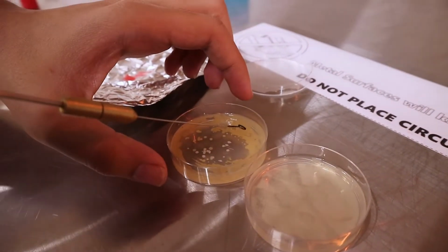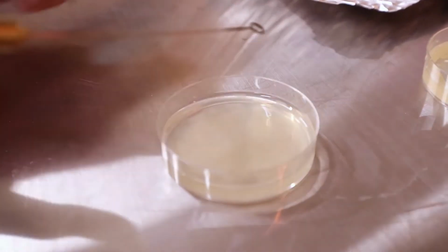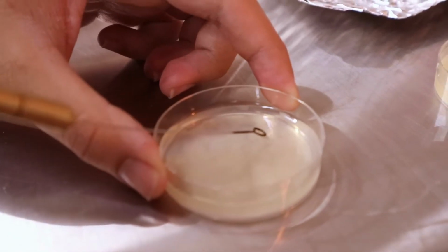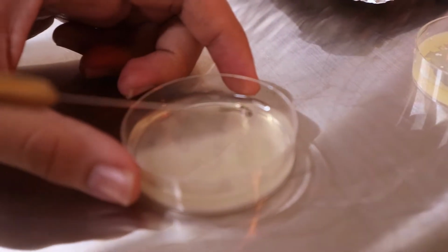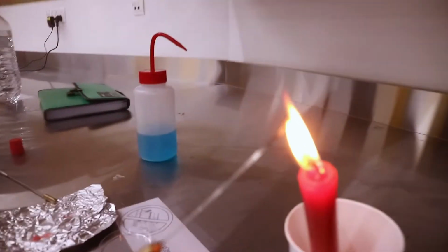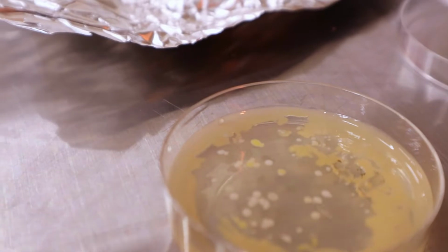Okay, so we will collect a bit of this, and we will draw on this. What shape do you want to draw? I will draw a B. B stands for bathroom, so there's the first stroke. Whenever you want to draw a second stroke, you need to sterilize it first. Yeah, so look. Let's burn it anyway. So, second stroke. It's black.